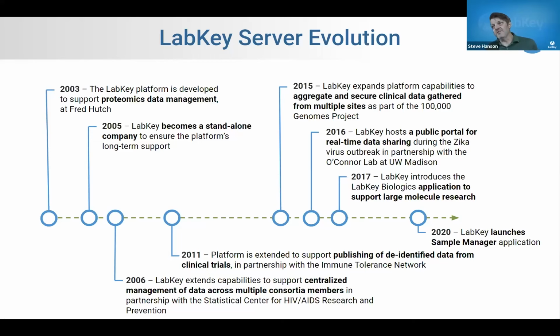Lots of features have been built out around proteomics. And ever since 2003, lots of other scientists have come to us and said, we've got too much clinical data, or it's too complex, or we can't figure out how to analyze it or structure it in a way that's optimal. Well, we helped them out, and that became the study module. We're going to look closely at the study module on day 3.